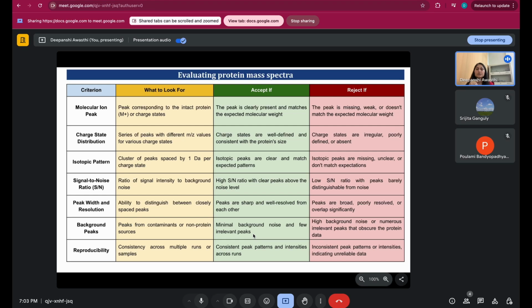But in certain cases, if there are a lot of peaks, especially towards the terminal region or at the end of the spectrograph, you should remember that the spectra should always be in a Gaussian distribution state. So if it starts low, rises and then decreases, and at the end you see sudden larger peaks, that means there is some contamination present. In that case you should ignore that spectra, or ignore those peaks while taking the measurements.